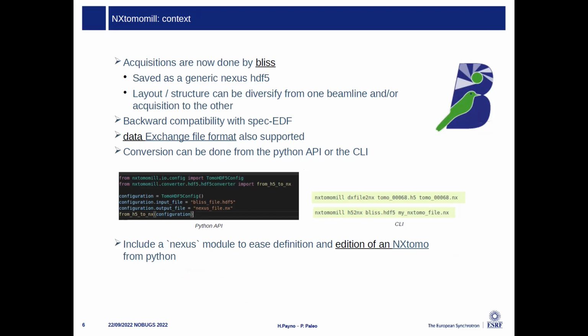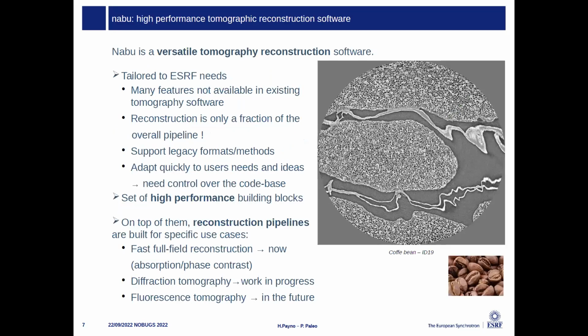And okay, sometimes it's complicated if you want to edit those. So there is a link where you have a notebook where basically you can construct an NXTomo from scratch. Then let's move to the core of the processing, which is NABU.